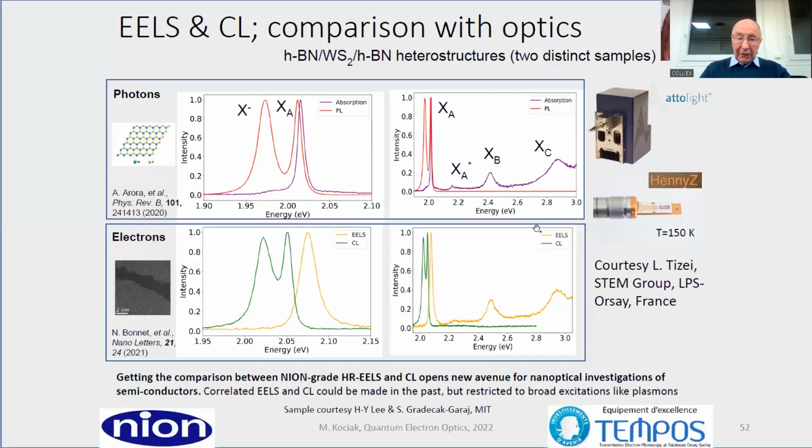Okay, and I show you this slide because this is exactly the present field of research that we are entering, going into details of this system. With this, you have the superposition of the system. This is the introduction of the system which is used for cathodoluminescence and so on. And this is the specimen holder for liquid nitrogen temperature.